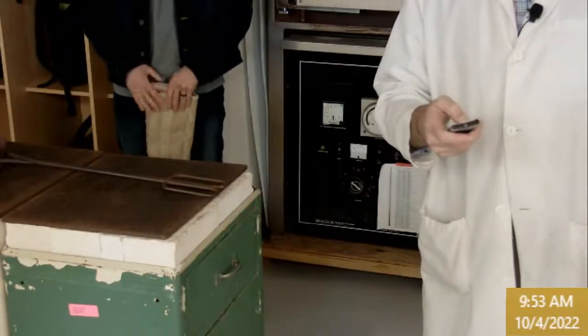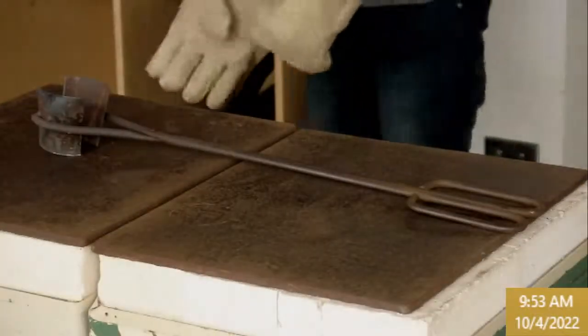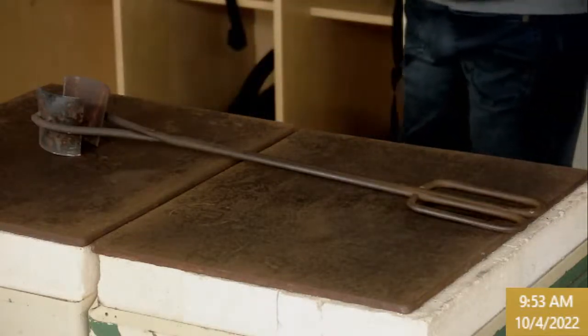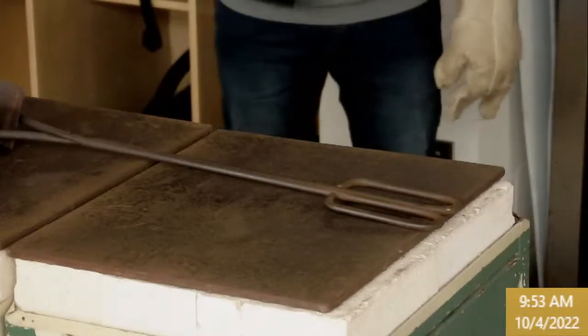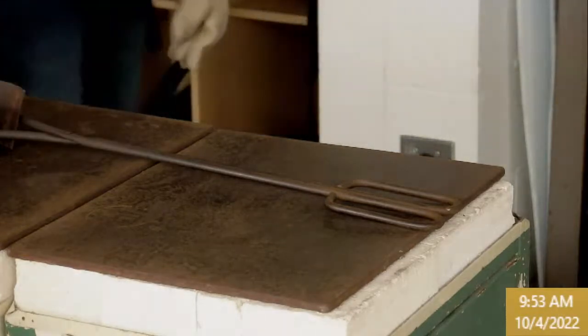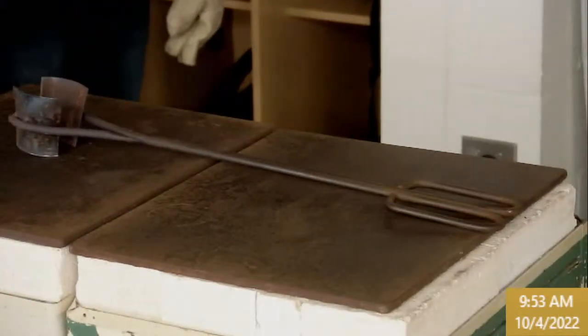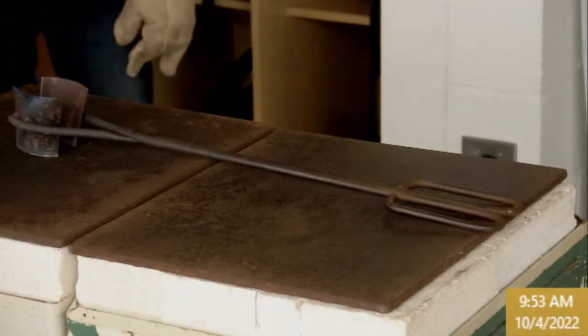And so once we pour the glass, we will then be having to wait because it'll be really hot. You could actually cook on this surface once we're done with it. And so we'll be watching a couple of different videos while it cools on glass and the two different ways that you can think of the glass industry, artistically or as a manufacturing process. And then once all that's done, we can move in and do our measurements. And then after some measurements, we'll also be able to use this little light table here to view the internal stress field of the glass.